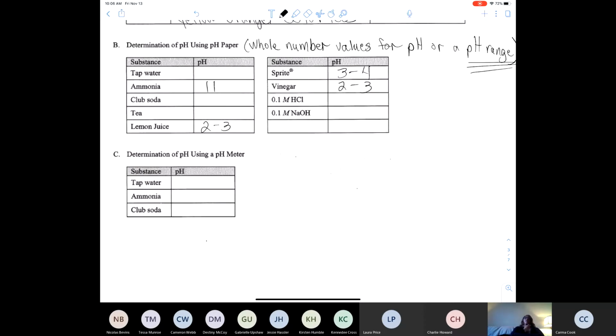And then there's the software program on all the computers in the lab called Logger Pro. With Logger Pro, you can use many different types of instruments and probes and connect your computer and your Vernier interface to those probes, like a pH probe, a temperature probe, a spectrophotometer, and so forth. And then you can use the software to monitor the temperature changes that take place during a reaction, or measure pH values like we did in this lab, or determine the amount of light that gets absorbed by a colored solution using a spectrophotometer connected to the Vernier Lab Pro interface device.